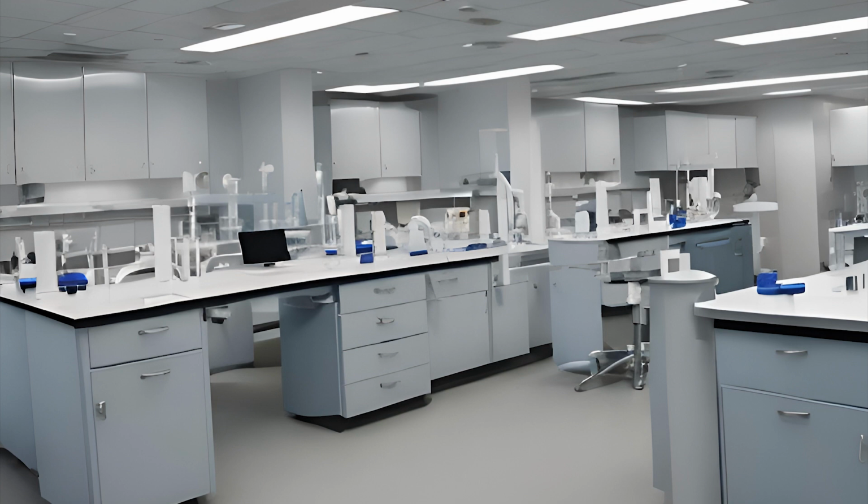Once you've spun it down and transferred into an aliquot tube, unless you label that tube as plasma or serum, there is not a way to just visually look at that sample and tell, because plasma and serum look identical to each other. Once you make that aliquot, you want to cover or cap that tube. Per CLSI, a serum or plasma aliquot can remain at room temp no longer than 8 hours.